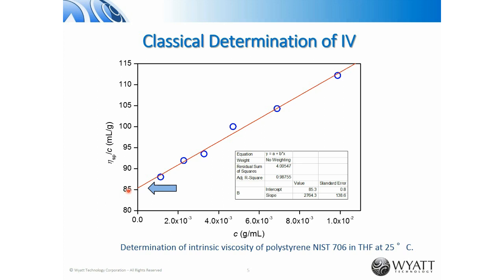Now when you use this in the context of chromatography elution, the process of fractionating means that you're almost always in this limit of very dilute solution. So we're going to use as a proxy for the limit of the specific viscosity divided by concentration, limiting to 0, we're just going to use the ratio, specific over concentration. Now, it's a great simplification when you use it as an online detector as opposed to a batch detector.